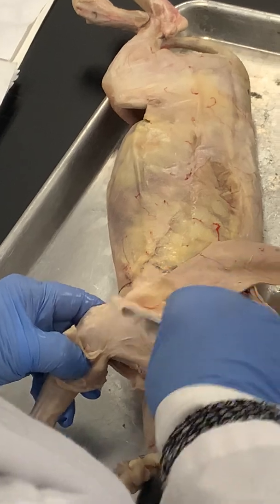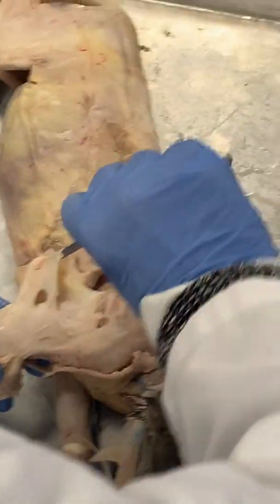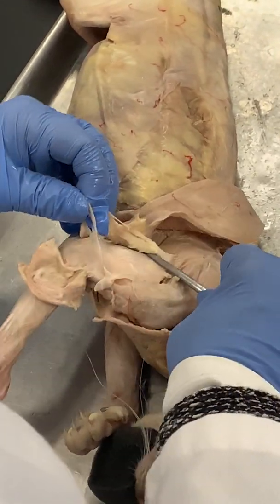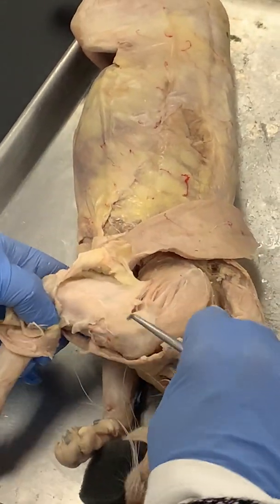So this is fascia — you can see that, right? Once I get the fascia lifted off, then hopefully you can see these upper arm muscles.